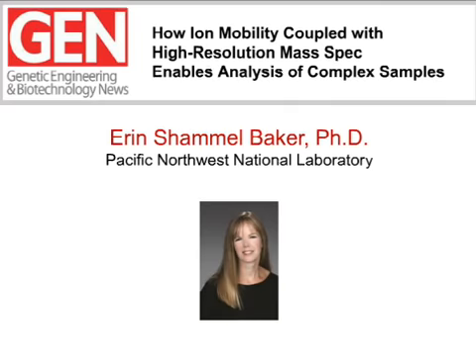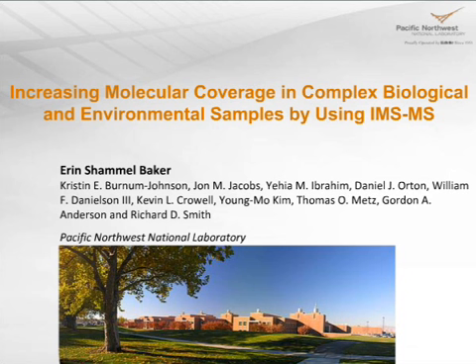Okay. So I'm really pleased to get a chance to talk to everybody today about increasing molecular coverage in complex biological and environmental samples using ion mobility mass spectrometry.